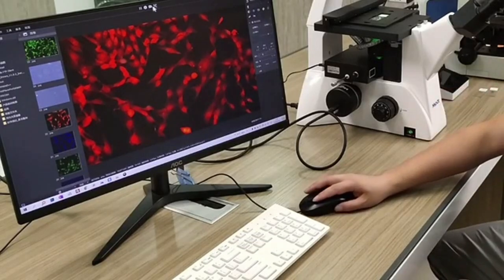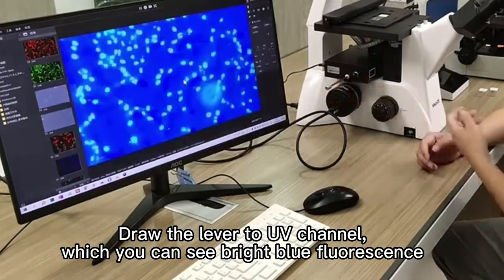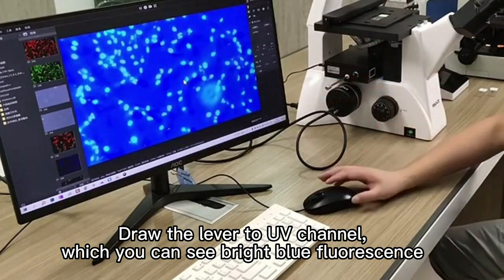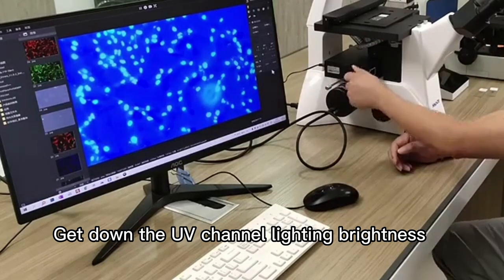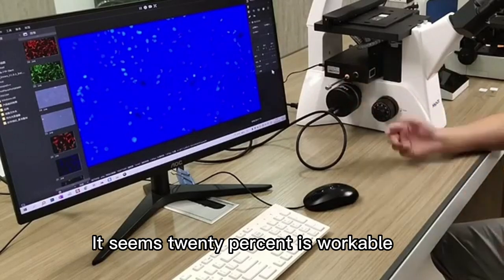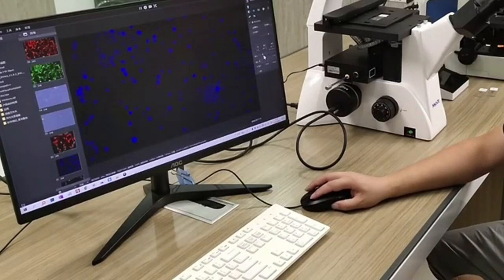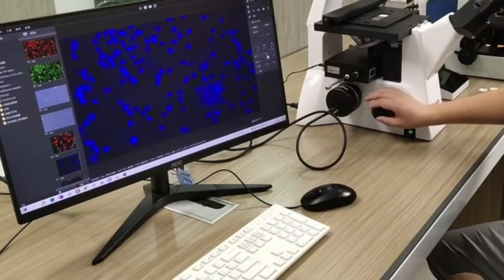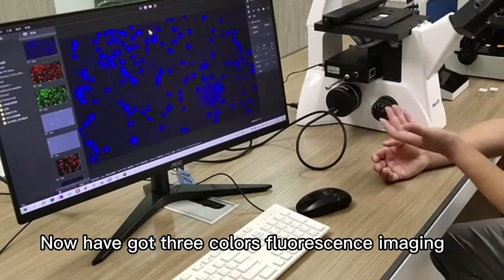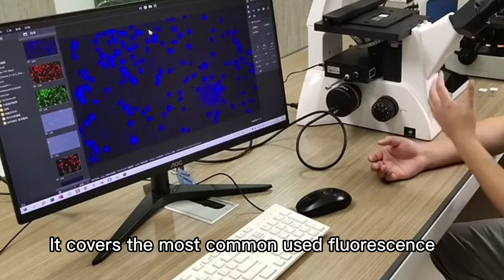Draw the lever to the UV channel, where you can see bright blue fluorescence. Get down the UV channel lighting brightness. It seems 20% is workable. Adjust the background in the software — imaging keeps getting better. Snap photo. Now I have got three-color fluorescence imaging, covering the most commonly used fluorescence channels.